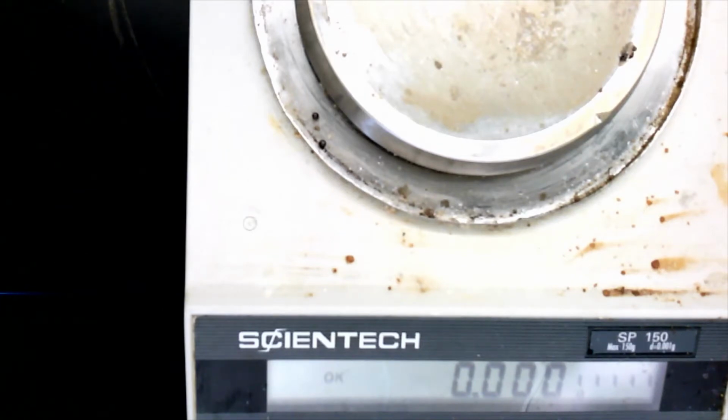Okay, so the first one we're going to do is procedure A, trying to find the empirical formula of magnesium chloride. Now, just from the name magnesium chloride, from your naming ionic compounds chapter, you should be able to predict what you think the empirical formula would be that would make this charge balanced, if magnesium and chlorine are in their normal charges that we know they like to form from the periodic table.